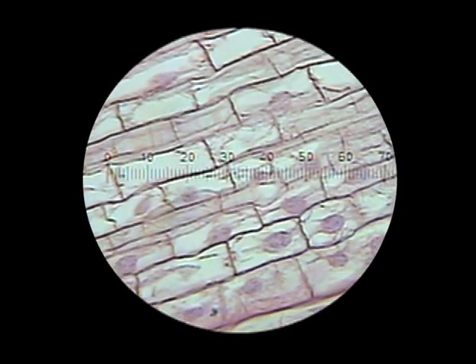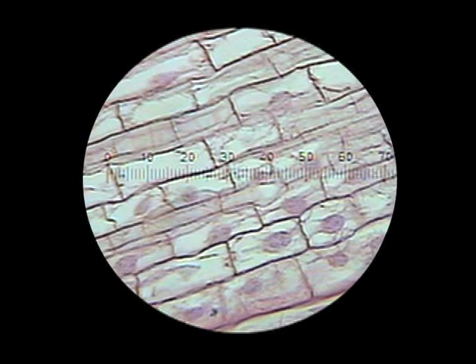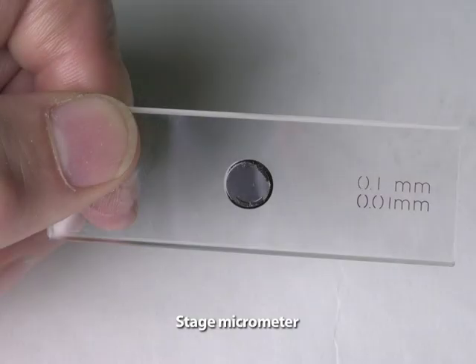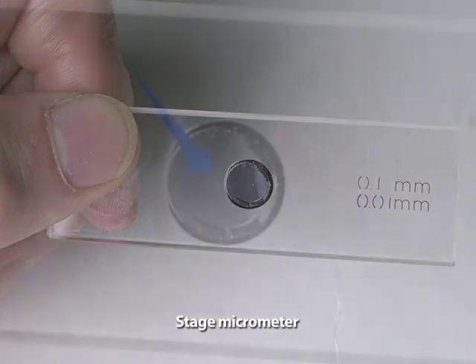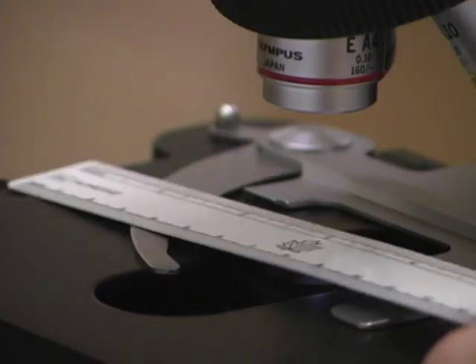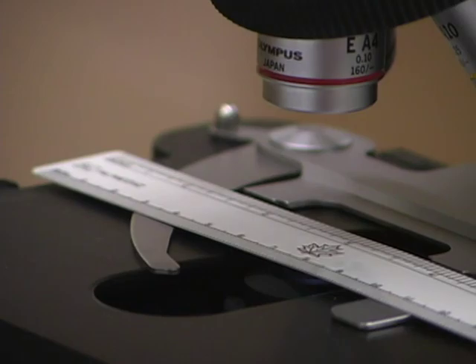The divisions on an ocular micrometer must be calibrated at each magnification setting of the microscope to a stage micrometer. A stage micrometer is nothing more than a very fine ruler. In fact, one can use a millimeter ruler to calibrate most magnifications.